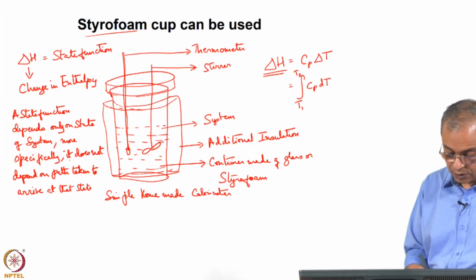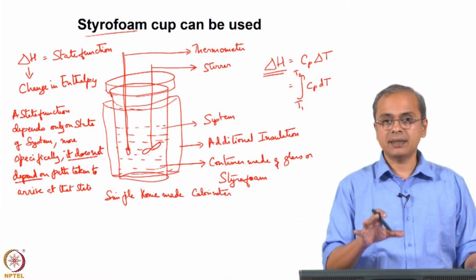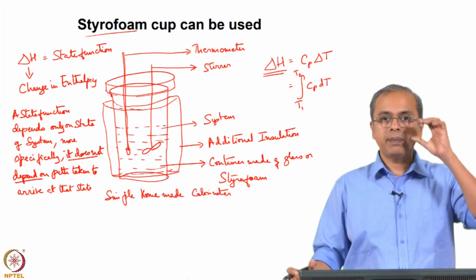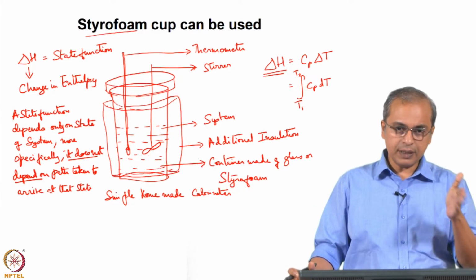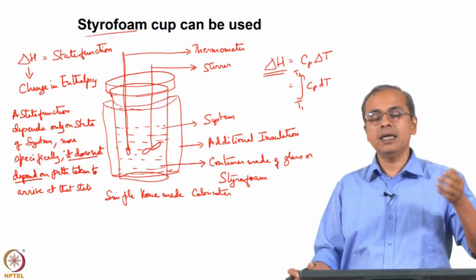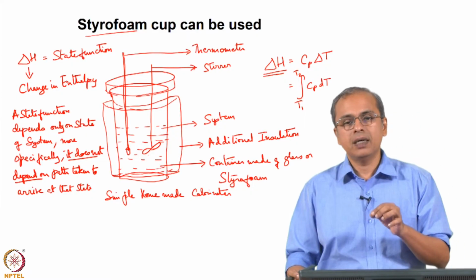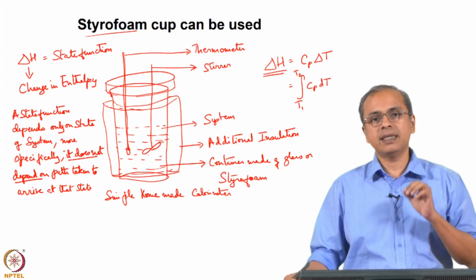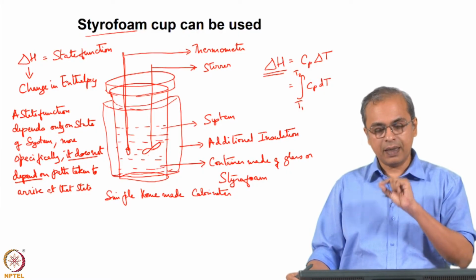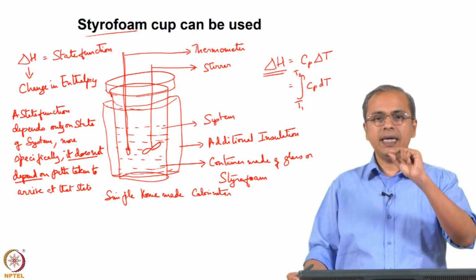Okay, so it does not depend on the path taken to arrive at the state. That is the important thing, and that is very fundamental to how the calorimeter works, because the enthalpy behaves in this manner, the fact that it is a state function. It does not matter whether you start at, let us say, room temperature, and you are trying to find the change in enthalpy associated with some material going from, say, room temperature to say 80 degrees centigrade.